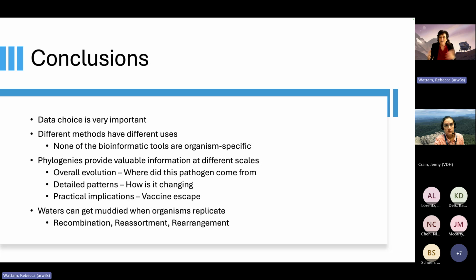evolutionary path, which I always tend to default to because that's what I'm thinking of, the overall evolution of it. But for public health people, they're interested in the changes in those specific genes. And so I would think that the rapidly evolving genes, and everybody is using HA and NA, it seems to me. So you could even concatenate those together in the tree.